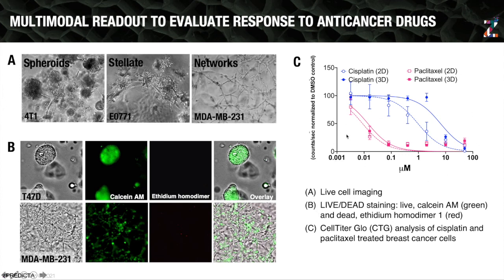as shown here on the right, looking at, in this case, cisplatin versus paclitaxel in 2D and 3D, showing that, for example, in this case, paclitaxel was significantly more potent than cisplatin, and showing also that we do, as I said very early on in this presentation, capture environment-mediated drug resistance in our system, where in 3D, the response is less potent than in 2D, really showing that ECM and some of these media supplements do drive additional resistance that has to be captured during drug development before the compound goes into the clinic, so that we can see when this compound is going to see the same ECM in the patient, the same soluble factors in the patient, if it's going to still maintain its potency.